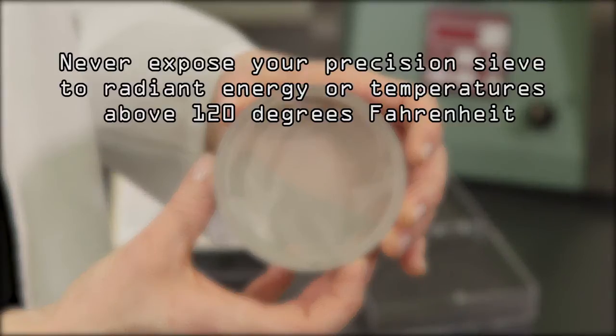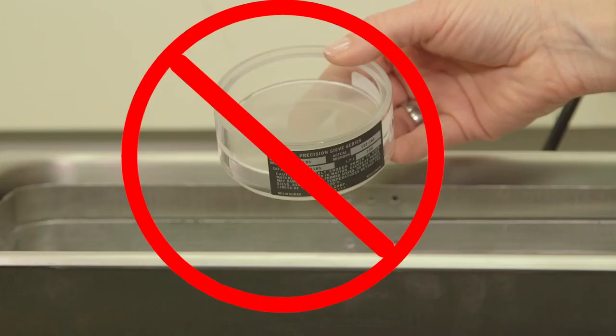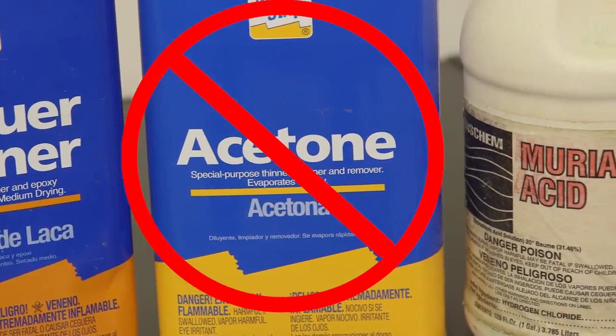Never use a brush or forced air to clean precision mesh. Never expose your precision sieve to radiant energy or temperatures above 120 degrees Fahrenheit. Your precision sieve may be washed in a solution of mild detergent and water. When cleaning, hold the sieve in the vertical position and gently rinse with distilled water only. Allow to air dry. The use of ultrasonic, mechanical cleaners, or any other cleaning method is not recommended.